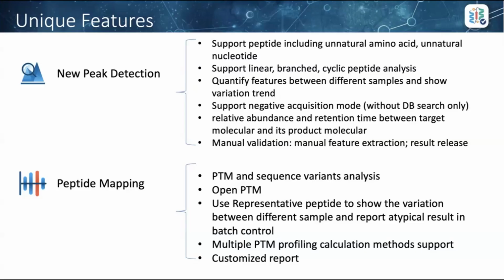In those two workflows, not just identification, we also give you quantitative insight so that we can compare relative abundance across samples.